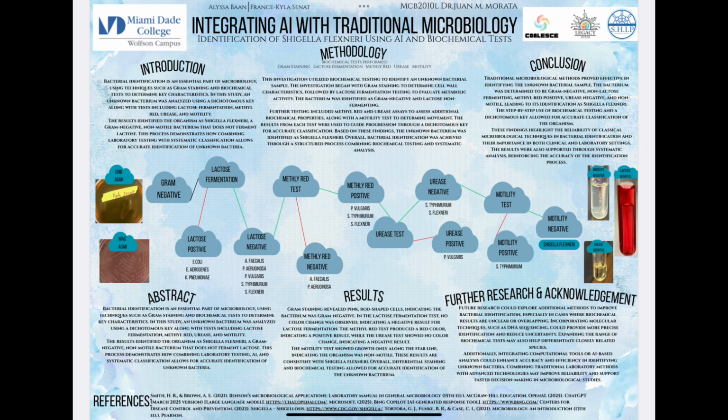Our methodology utilized biochemical testing to identify an unknown bacterial sample. The investigation began with gram staining to determine cell wall characteristics, followed by lactose fermentation testing to evaluate metabolic activity. The bacterium was identified as gram negative and lactose non-fermenting.